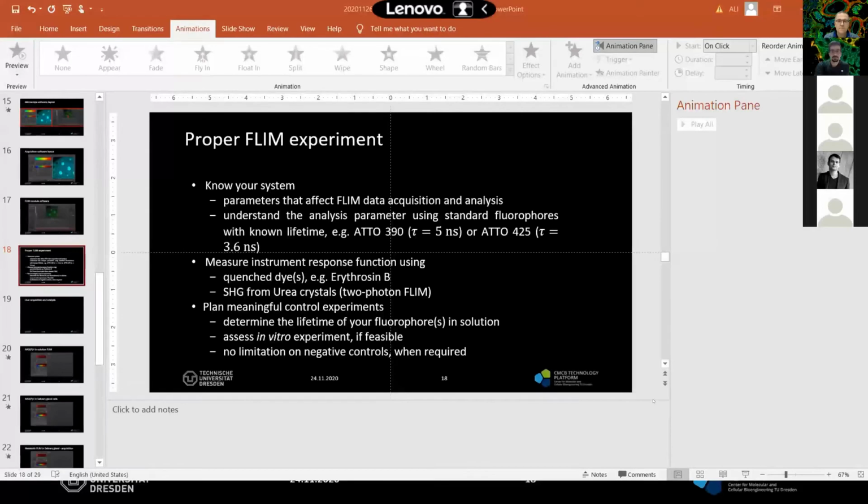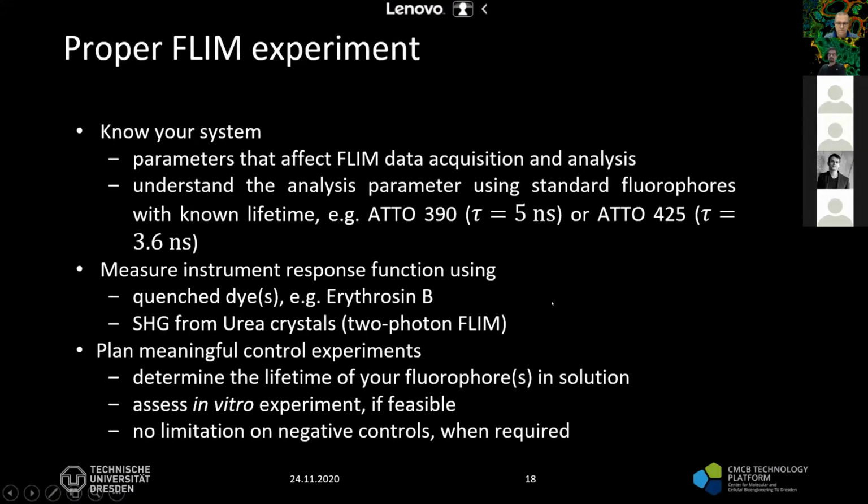Yes, sure. In the quantitation of the lifetime signal, we do not depend on one value like chi-squared. Mainly you have to justify when you use lifetime imaging systems based on your biology and your experimental condition, and that's how you have to determine. We cannot go with one number, say a lifetime value.